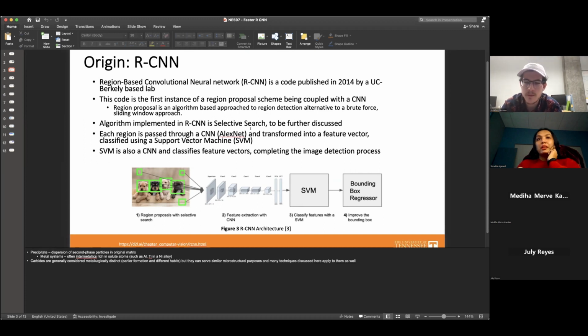I think this is written FCN, fully connected, right there. So the image is flattened, and now it goes into that neuron treatment. It goes into the neurons, and it directly predicts the classes that it has to predict. Then they are using another algorithm, that is SVM, when we have already predicted classes here?